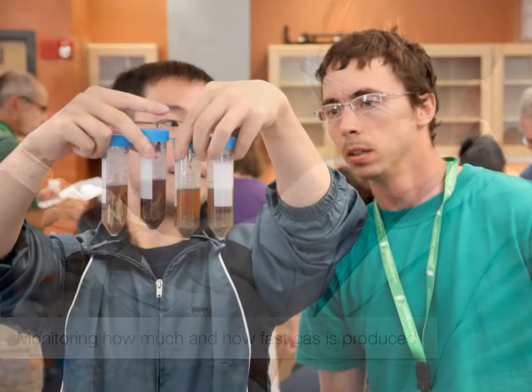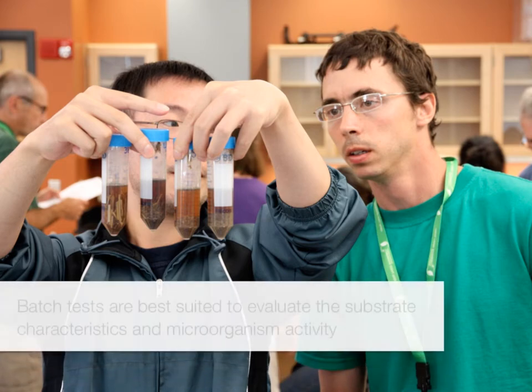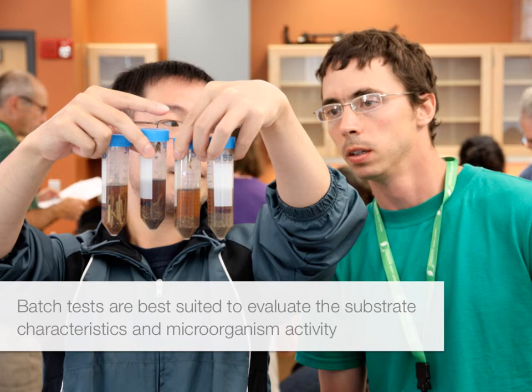Batch tests are best suited to evaluate the substrate characteristics and microorganism activity. For example, it can be used to screen different substrates or to study the effects of different pre-treatments on a substrate, as discussed in Lesson 1.